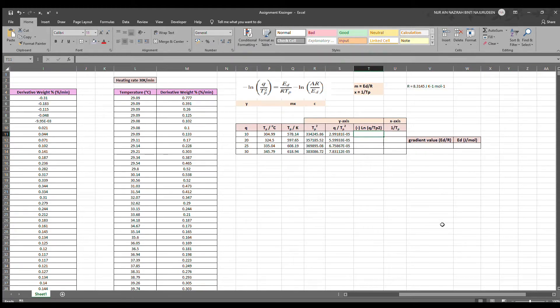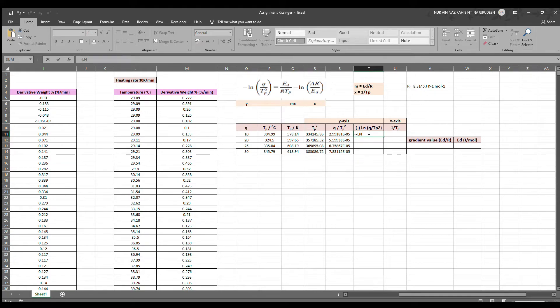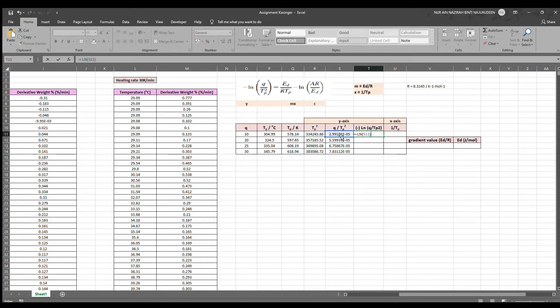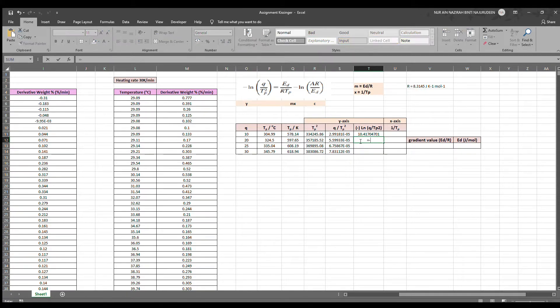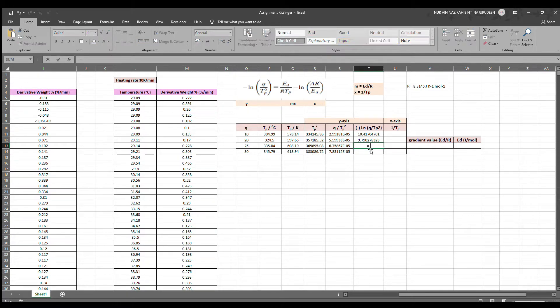For the next insert, we have negative ln Q over TP squared. What we have to do is type negative ln and we click on the previous calculation of Q over TP squared. And that is how we will get the answer in these cells. Bear in mind that we have to have a bracket before the values so that there will be no error.